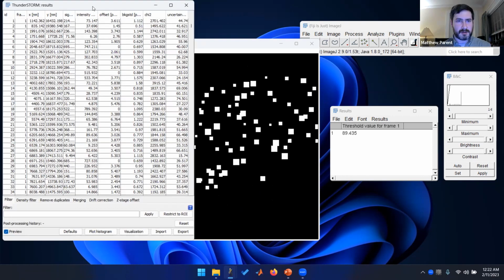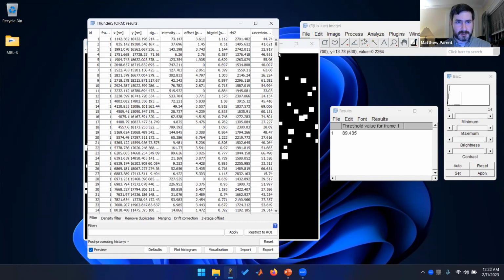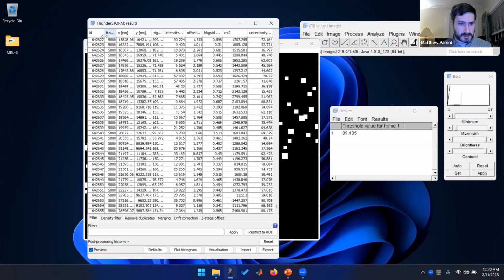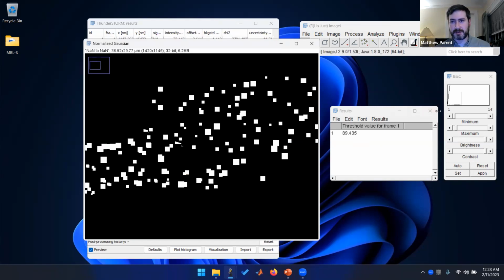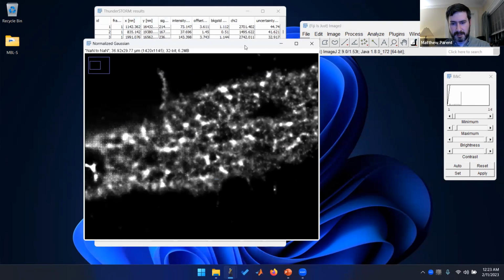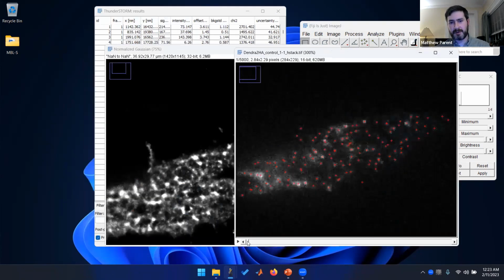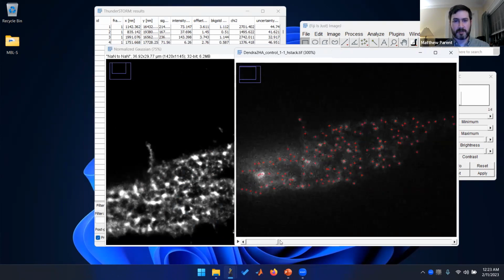All right. So now I have this huge list of molecules. How many did it find? It found 642,655 molecules, and it's glitched out my render. There we go. And usually, oh, there it is. It will give me the raw data back with all of these plus signs to indicate where the molecules were.